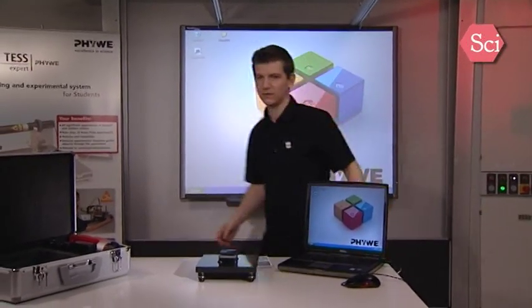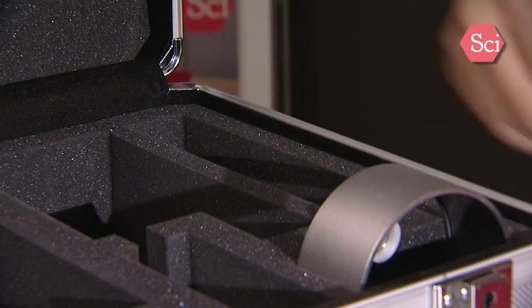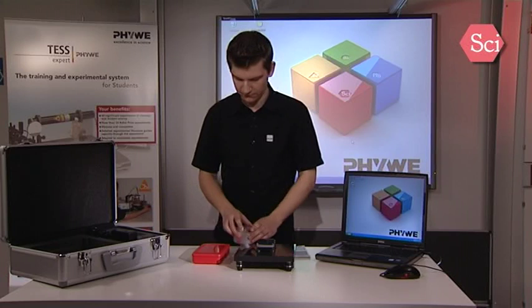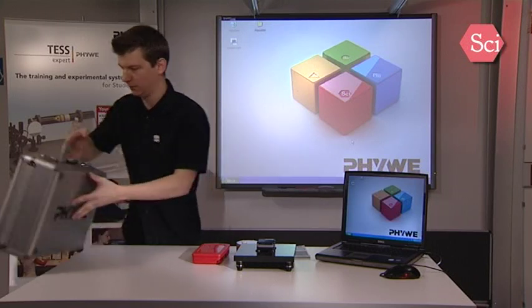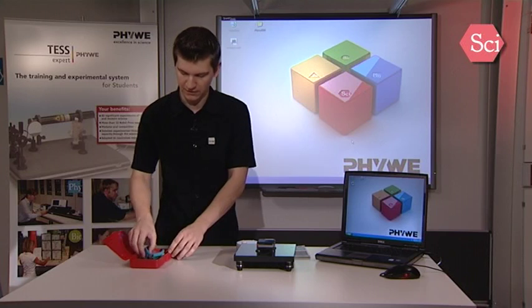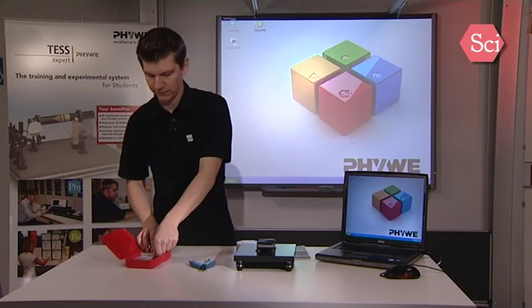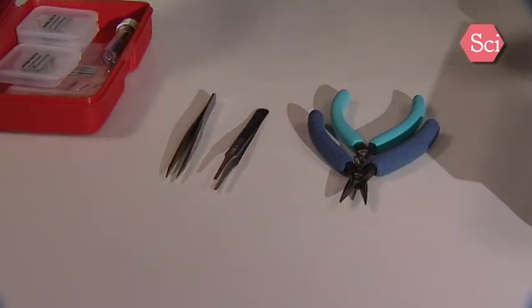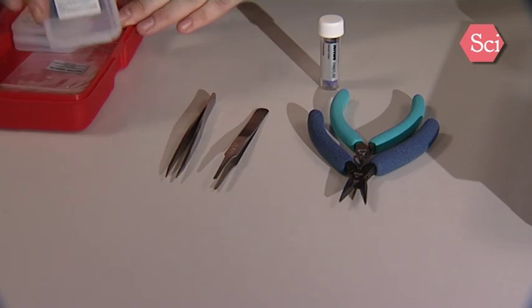We are now ready to prepare the sample and the measurement tip. For this we use our toolbox. For later covering of the microscope we have the cover glass. In this toolbox you will find everything to prepare a fresh measurement tip and to prepare the sample. We have tools to cut the wire, tweezers to handle the tip wire and the sample, the sample holder, and our graphite sample on which we will achieve atomic resolution.